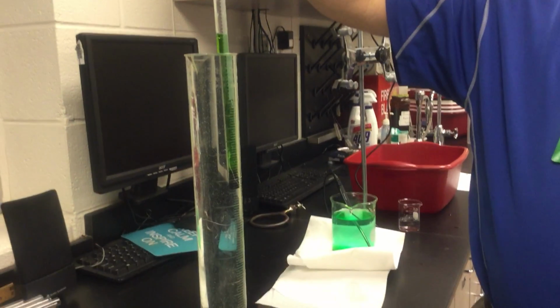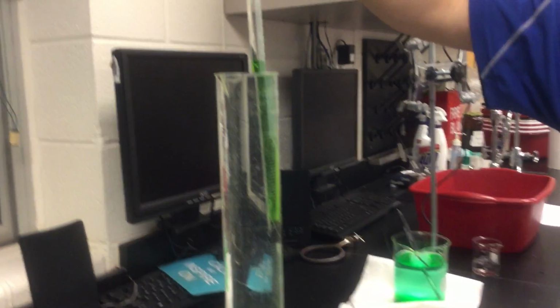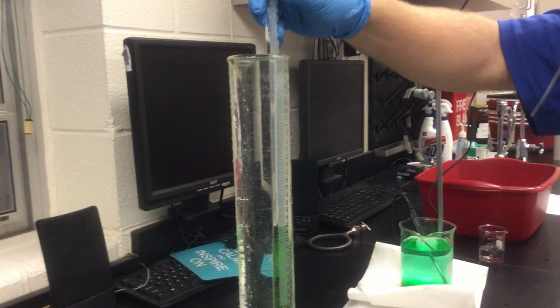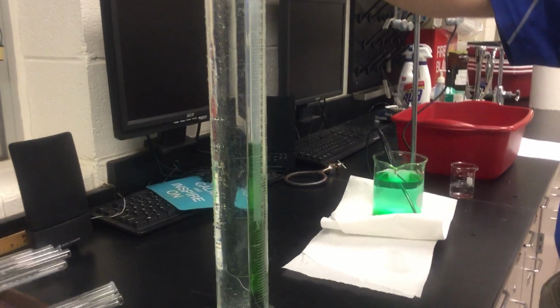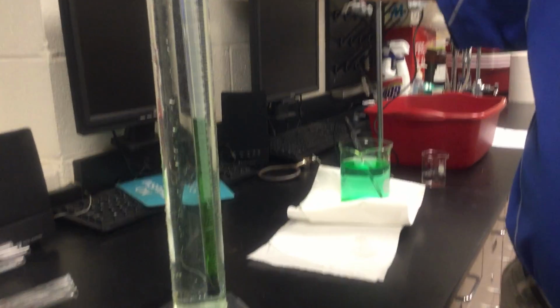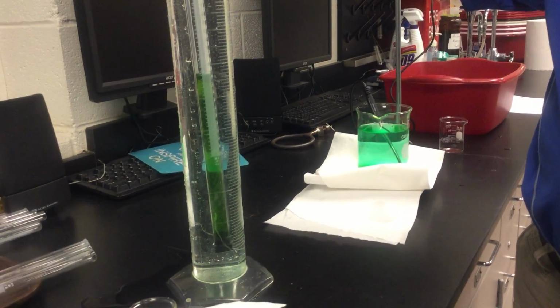Yeah. Okay? I'm reading right now at about 40.8. Now come back here. Don't go so far. Watch what happens when I go down and I increase the pressure. Okay? What am I reading now? Less than that. Okay? So by increasing the pressure, I have decreased the volume.